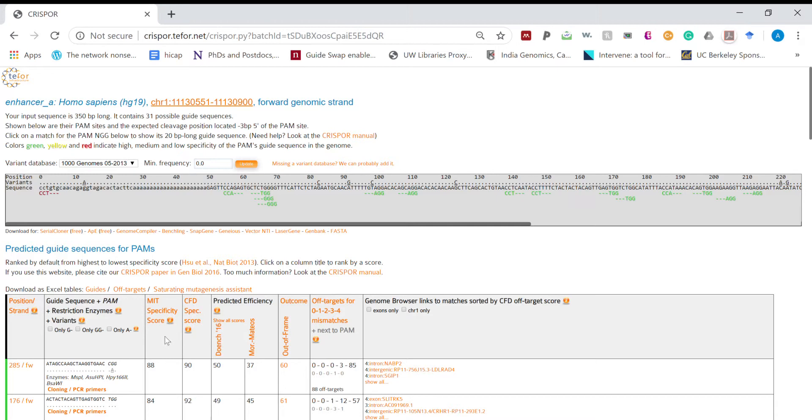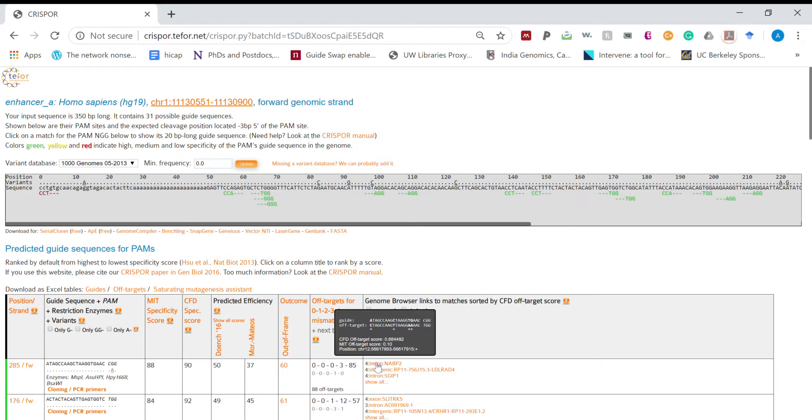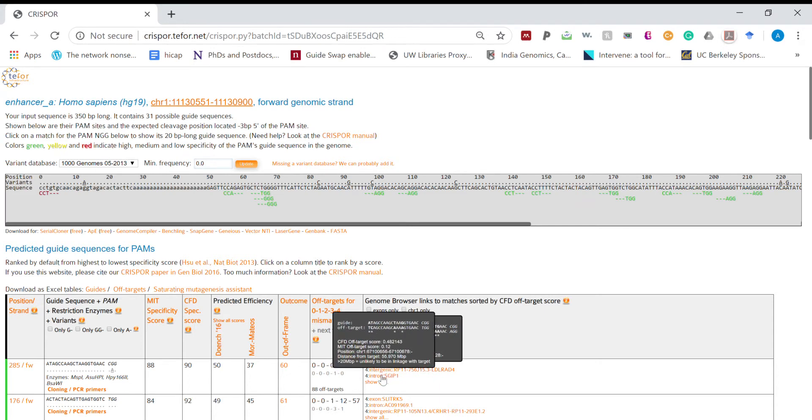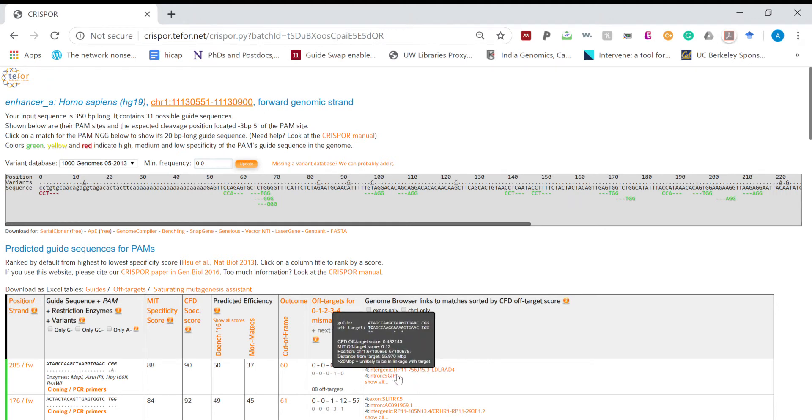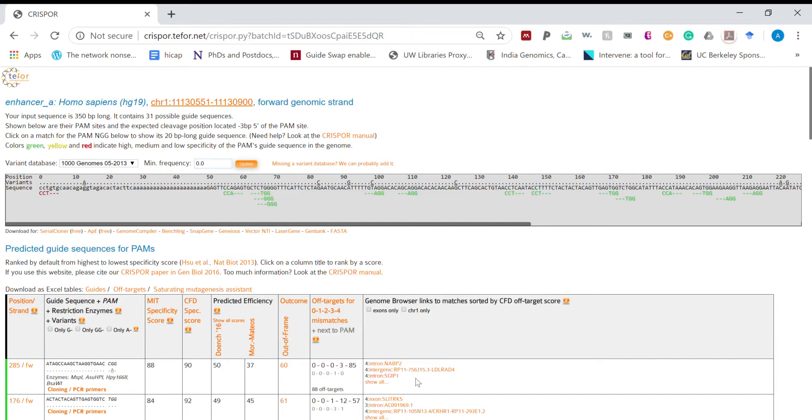So we will select this guide and we can note down that these are the possible off-targeting sites. And here we can observe most of the off-targeting sites are either intronic or intergenic in nature. Thus it will have least effect compared to the off-targeting sites which are exonic in nature.